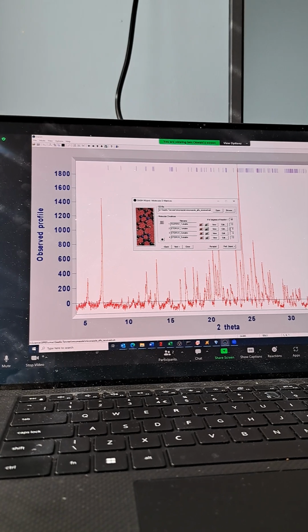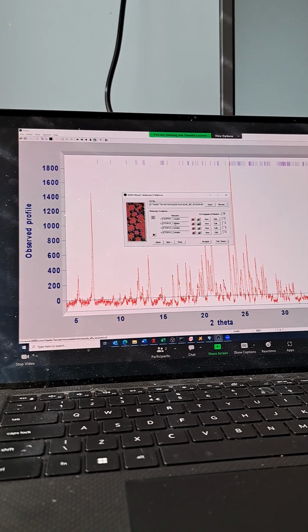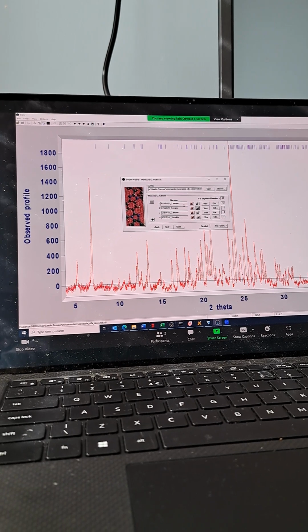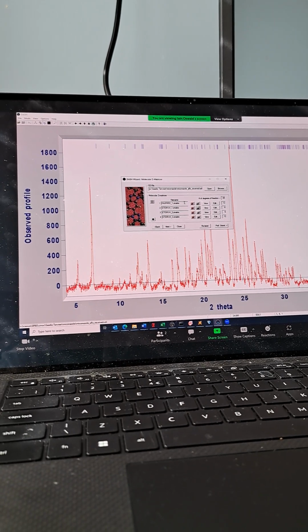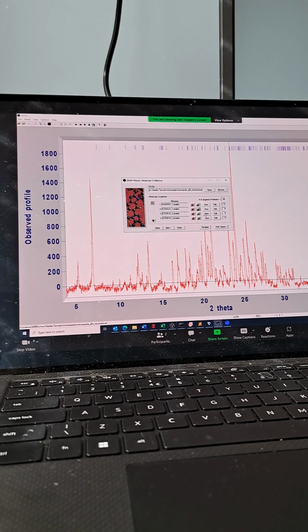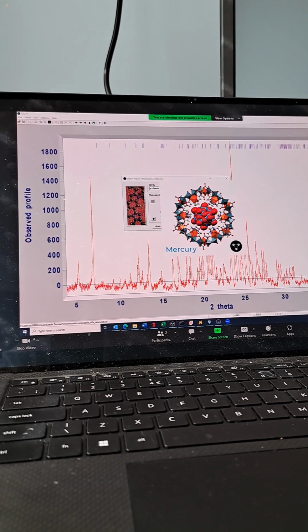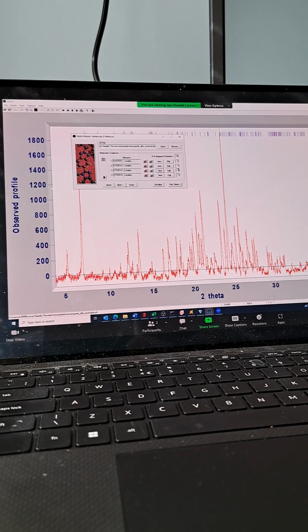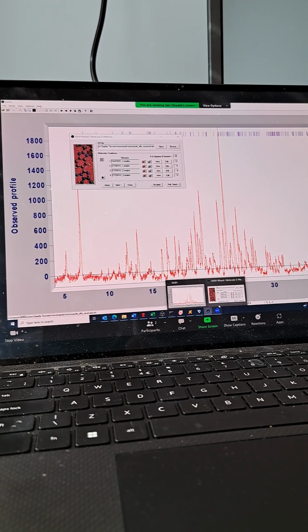What you can see here is this ET1 or whatever. There are 3 molecules in that. That is miconazole nitrate. So that's the miconazole, and it's possibly a couple of nitrates. You can see Z-matrix 1 and 2 each have 6 and 6, so they're likely to be the same thing.